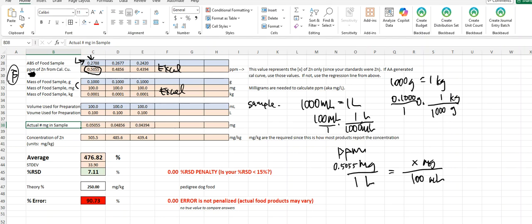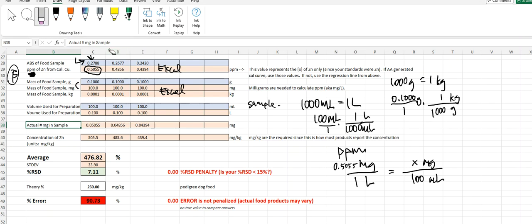So it's not necessarily concentration. It is like a legit amount that is present there. Okay. So here's the story with this. There's a little bit of a problem because this is 100 mils and that is 1 liter. So I need to convert 100 mils into a liter, and I take 100 and divide by 1,000 and I get 0.1. So we did that already. That's right up here at the top. I spelled volume wrong, but I'll try to fix it by the time you get it. But it's right there, 0.1 liter.